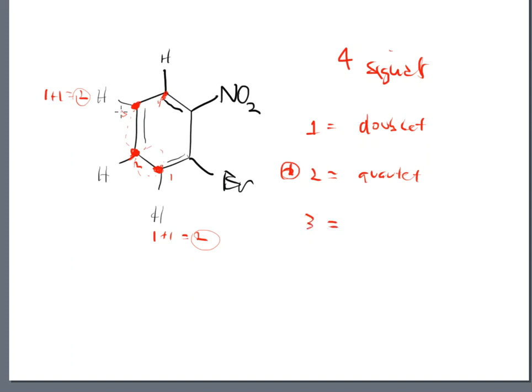All right, carbon number 3 is here, and then the same thing would happen at this spot as well. We would go next door and we would see that carbon that has a hydrogen on it, and that is a different signal than the carbon that's down below once we visit that neighbor. So because of that, we would see a 1 plus 1, which is a 2, and then here we would see another 1 plus 1, which is a 2, because they are 2 different sets of signals here, right?